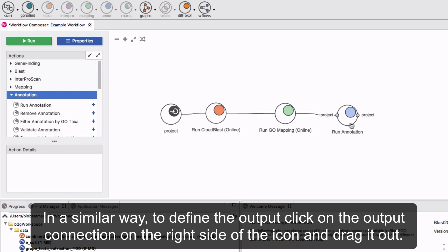In a similar way, to define the output, click on the output connection on the right side of the icon and drag it out.